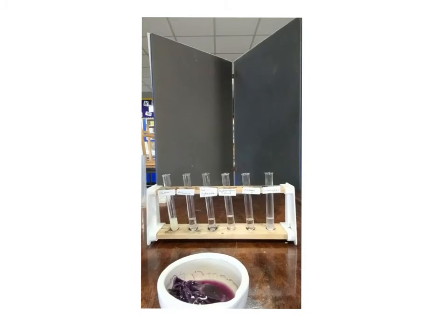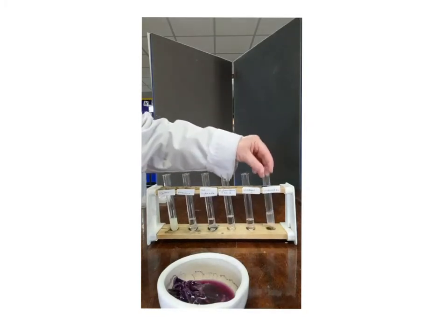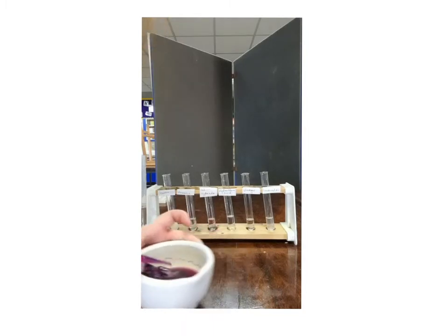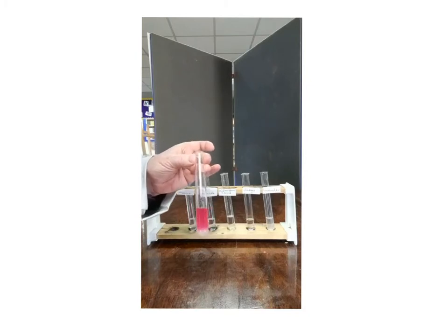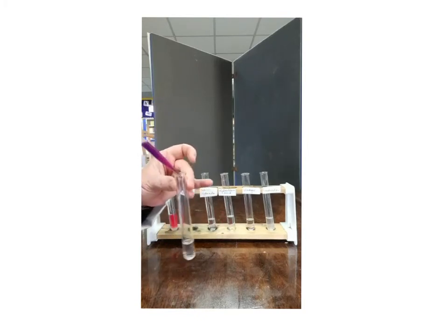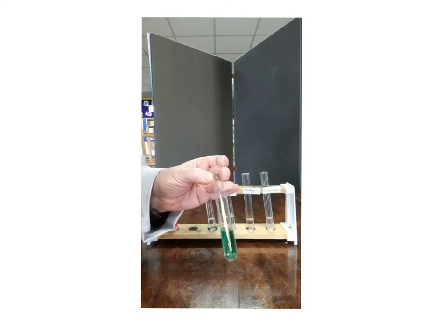I have 6 test tubes with lemon, ammonia, sodium hydroxide, hydrochloric acid, vinegar and lime water. And to each of these substances I'm going to add a red cabbage indicator. So into lemon, it has turned it a pinky red colour. With ammonia, the indicator has turned the ammonia a greeny blue.